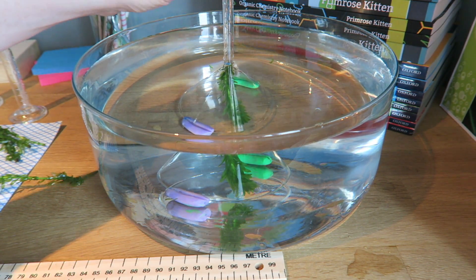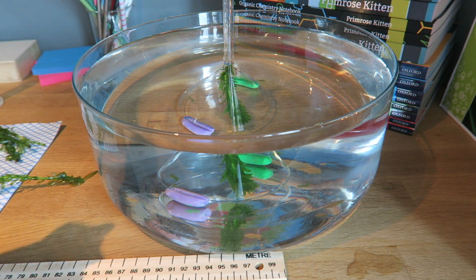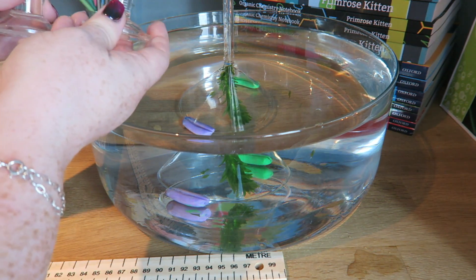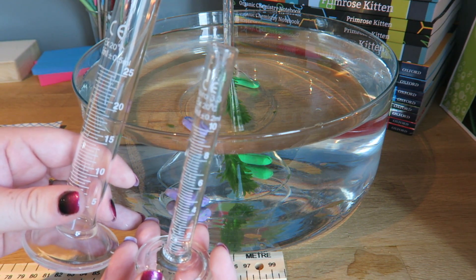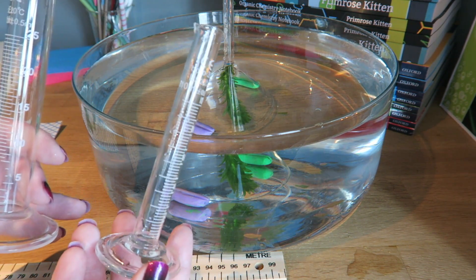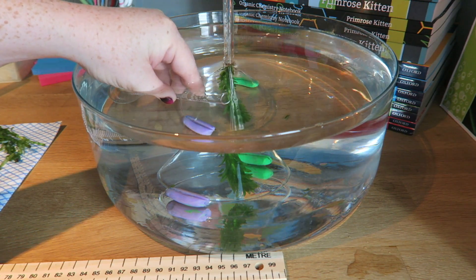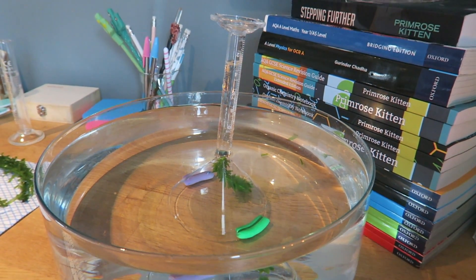The pond weed naturally wants to poke up at the end. Now, we are not expecting to collect a large volume of gas from this, so you need to decide which is going to be the most appropriate measuring cylinder to use. The most appropriate one is going to be the smallest one — I'm going to use the 10 centimeter cubed measuring cylinder. I'm going to fill this up with water and then invert it over the top of the funnel, which is over the top of the flask.